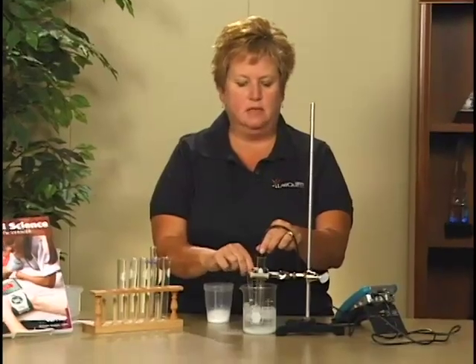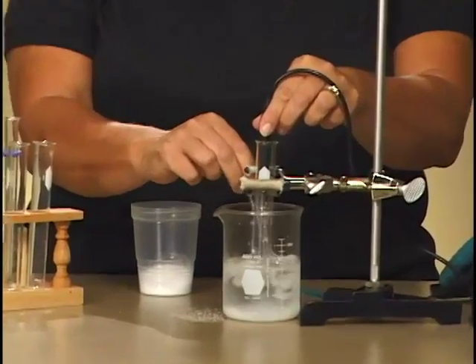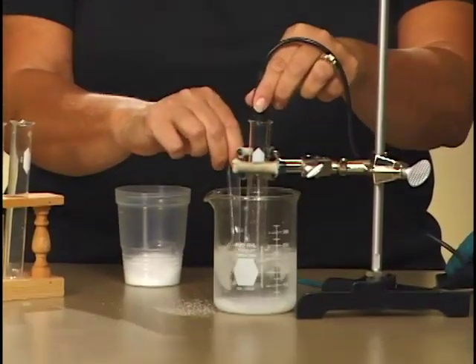You want to keep the end of the temperature probe down in the water in the test tube, because that's where we're investigating the freezing temperature of the water.